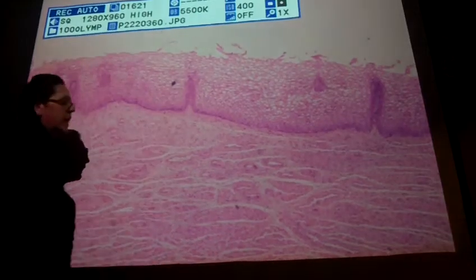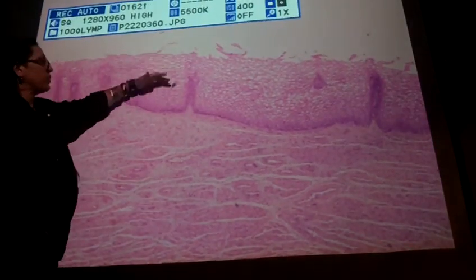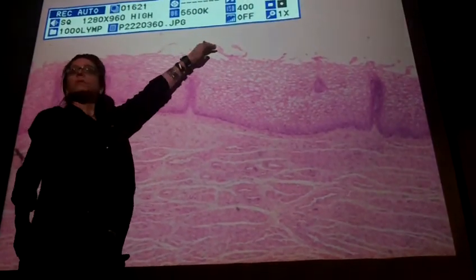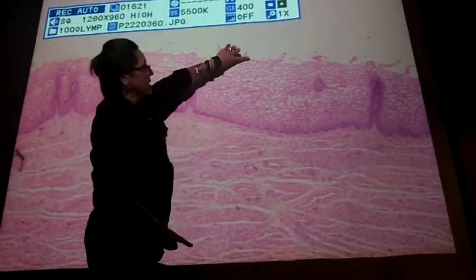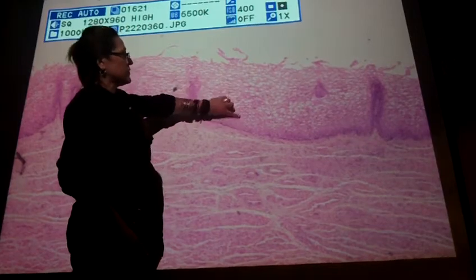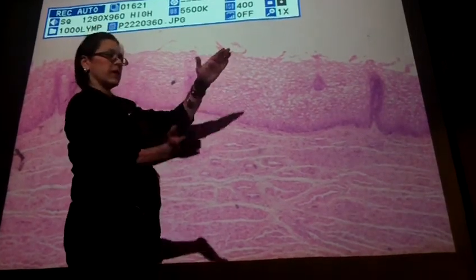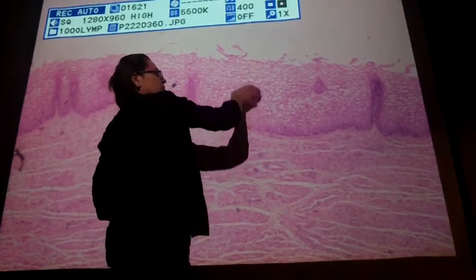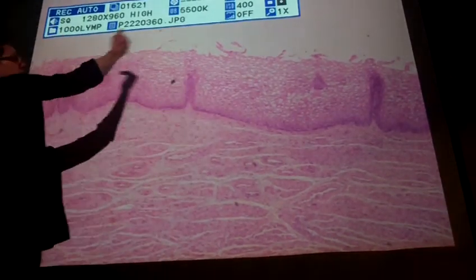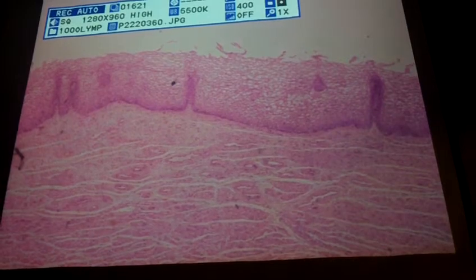You're looking at just one half of it. This would be the epithelia that lines the inner part of the vagina. And again, you should be able to see layers of cells stratified. The cells look like they're kind of squashed, squamish. These are really durable cells because the vagina has to deal with a lot of abrasion.